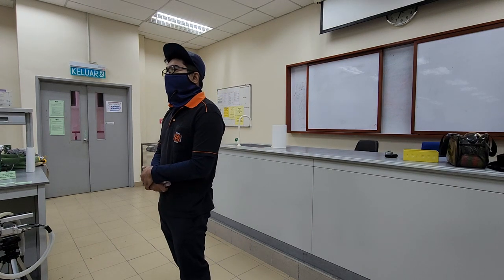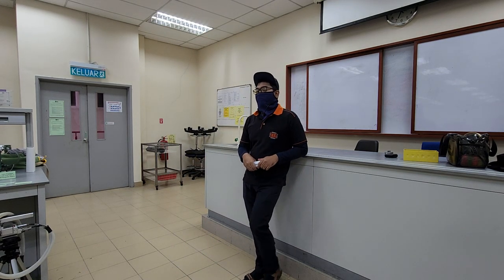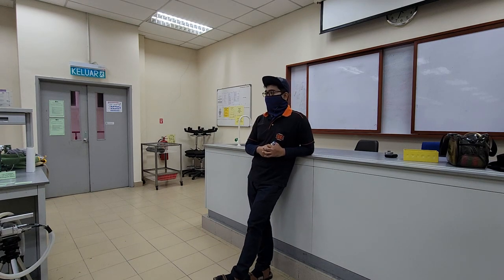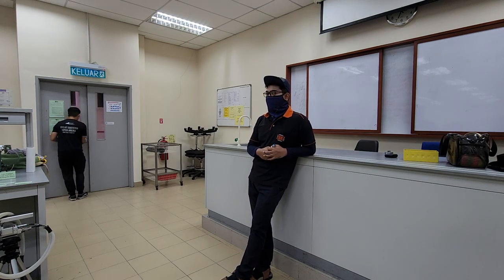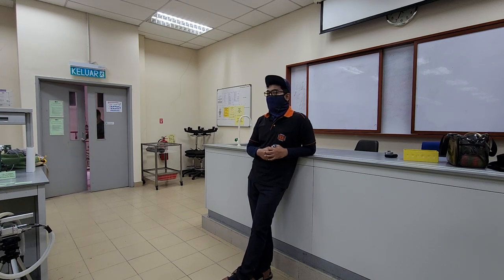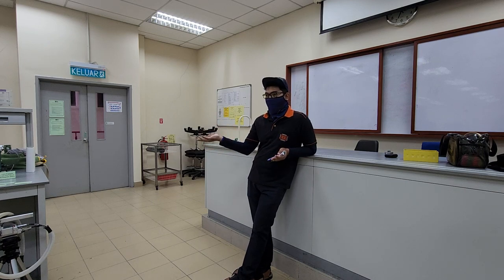I tell you what, regardless of any crop production discipline that you are going to take, regardless whether you are a breeder, physiologist, agronomist, horticulturist, biochemist, and so on, you will see that maybe like 90% of the people, they are going to use this machine because it answers the photosynthesis capability of your crop.